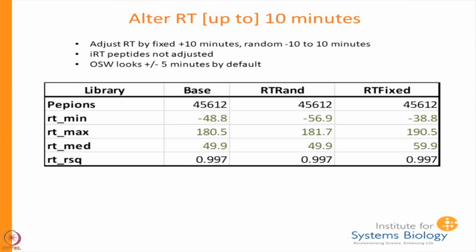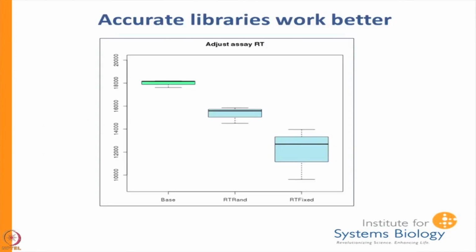Fixed one is the problem. That is correct. So basically, this is a so-called box and whisker plot. Basically, this is the median of your data. This is the first quartile, this is the third quartile, and this is the minimum and maximum. Although there is some outlier detection done, and so sometimes you can actually get some things below the minimum or above the maximum. But basically, it shows that the library that we started with has very narrow tolerance.